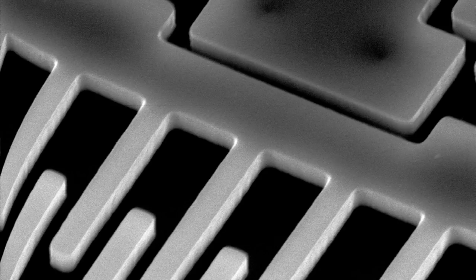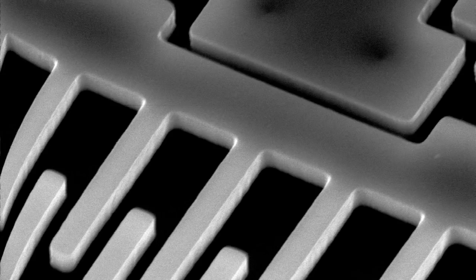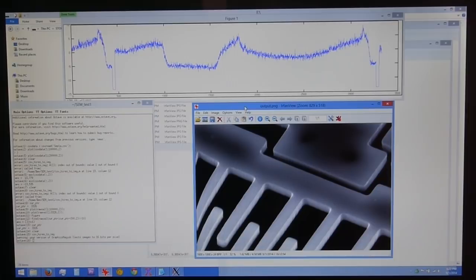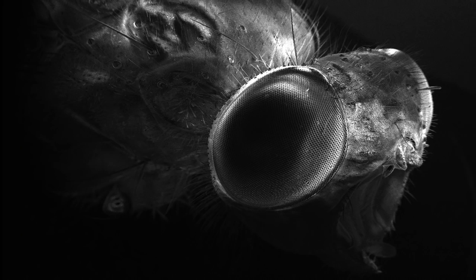And so here we can see the image that we just captured. This is the MEMS gyroscope. And as you can see, there's actually a little bit of distortion at the side here, mainly because the scanning electron microscope does not intend for the video signal to be picked off the circuit board at that point where I grabbed it. So when you tell it to make a photo, what it does is it actually uses a subsection of the screen. In fact, just this middle, probably about the middle 25% or so.